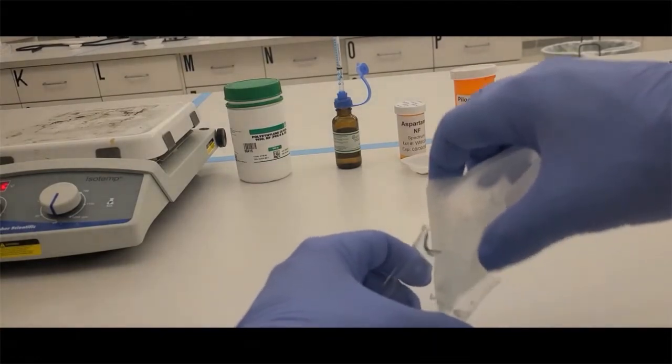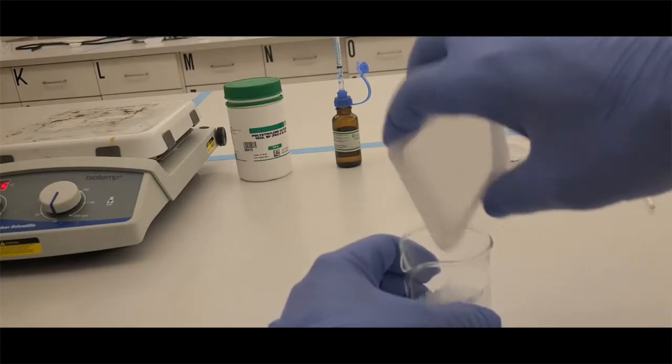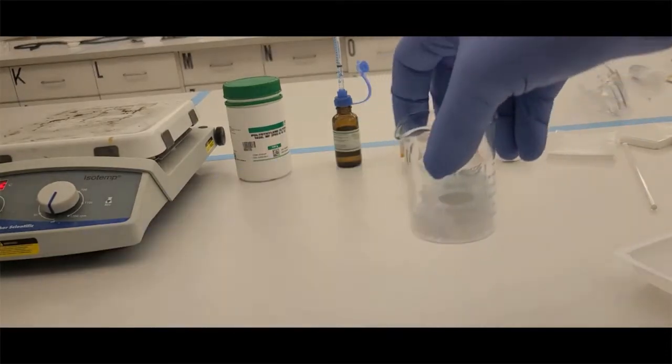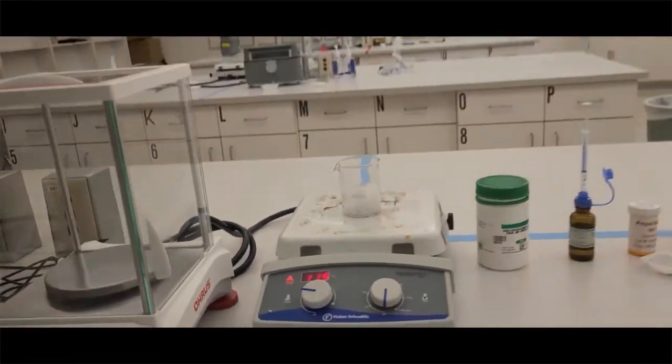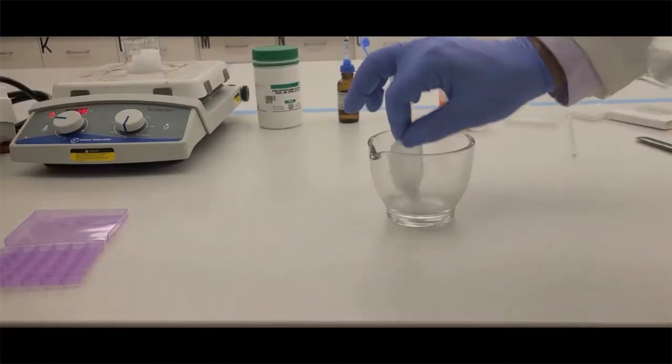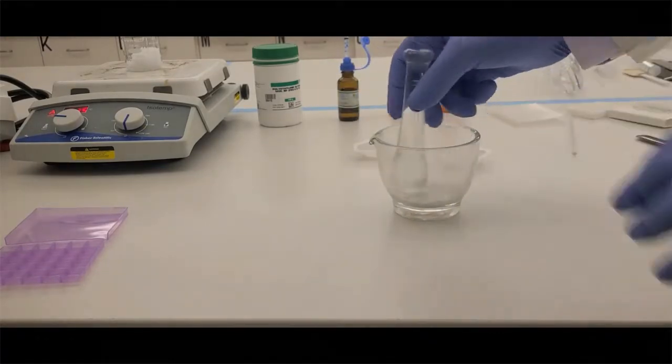So to get started, we're going to do the thing that takes the longest first. That's melting the peg base. So you can either weigh it directly in a beaker, or in my case, I'm just transferring it to a beaker. The calculated amount of peg base, we're going to put it directly in the center of the hot plate. Again, the temperature of the hot plate that you see is not calibrated. Using a thermometer is the most appropriate method.